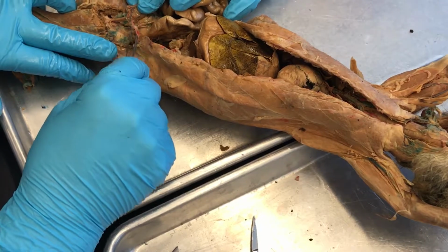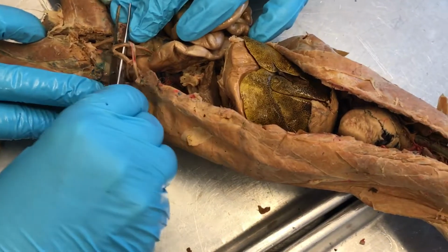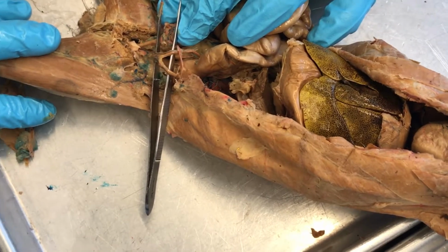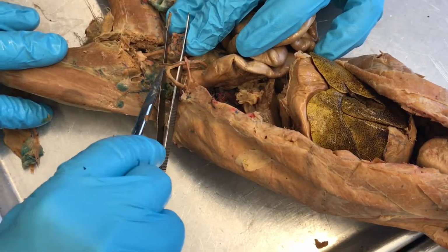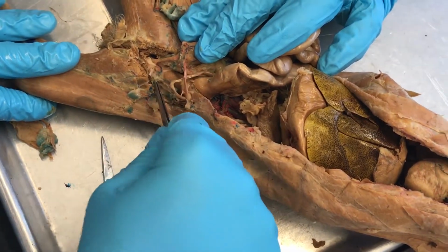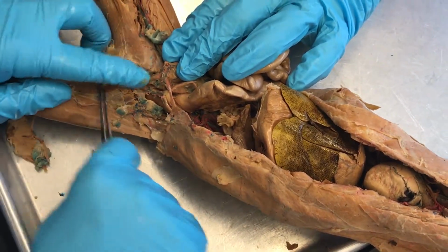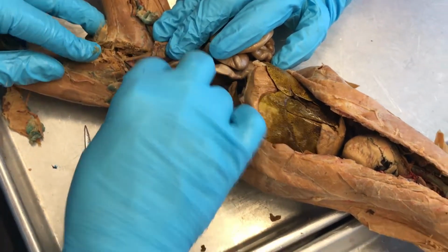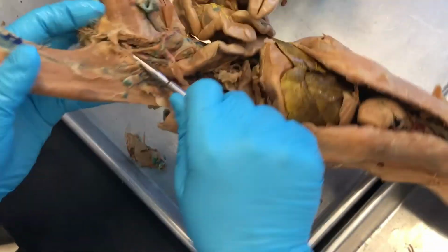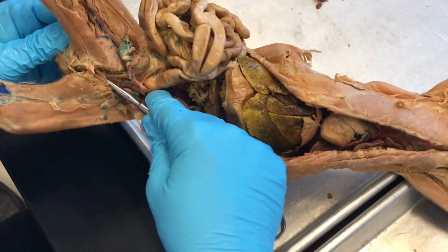Okay, can you see the Y-shaped thing here? Two uterine horns forming together to form a uterine body there at the end of the Y. Uterine horn right, uterine horn left, body of the uterus. As you go down the body of the uterus, eventually it will join with the urethra to form one opening to the outside. Down here, you should be able to get to the outside through a common opening called the urogenital opening.